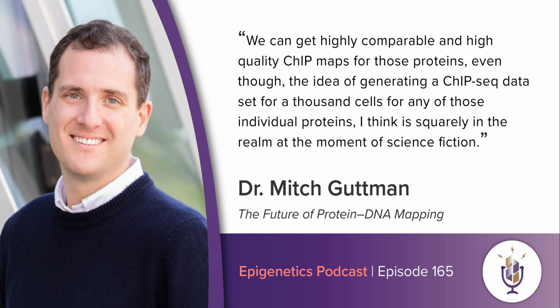On the other hand, if you have lower overall bead density and antibody concentration per target, you can drive many chromatin molecules on a single bead. And these beads are big, so they can actually accommodate many chromatin molecules. So if you have, for example, 10 or 100 chromatin molecules on an individual bead, then for every one oligo that you have to map by sequencing, you map 100 chromatin molecules. And so those are also very practical benefits, not just for reducing the cost of antibodies that you need to use, but also in reducing the cost of sequencing and increasing the information content of the experiment itself.